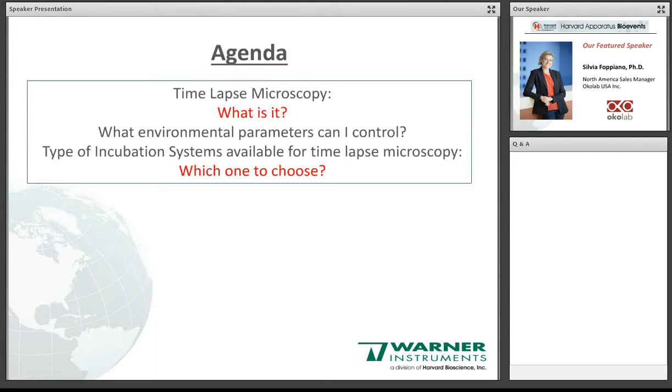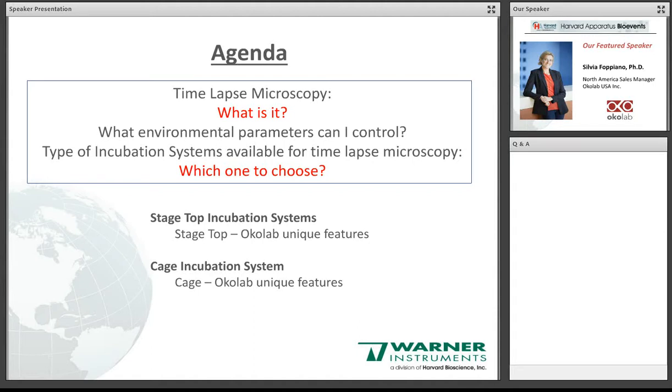Here's the agenda for today. What is time-lapse microscopy? What environmental parameters can I and should I control? What type of incubation systems are available for this purpose, and which one do I choose based on my experiment? I will then move on to describing how Okolab manufactures and designs our stagetop and cage incubation systems, and then I'll conclude with a summary.